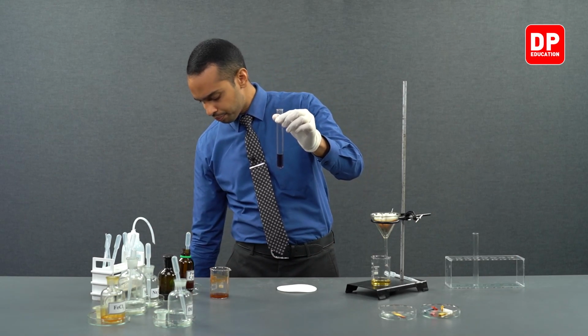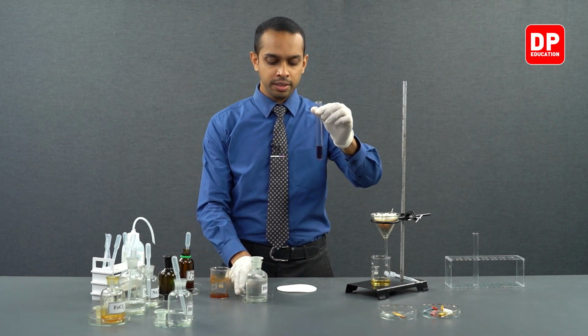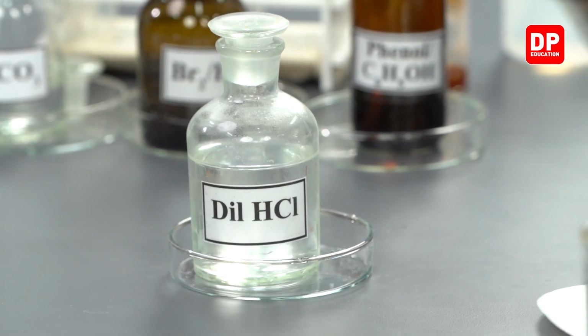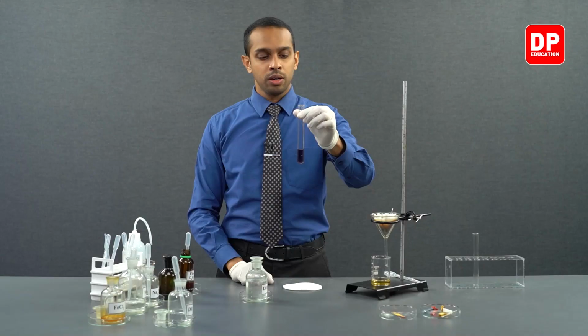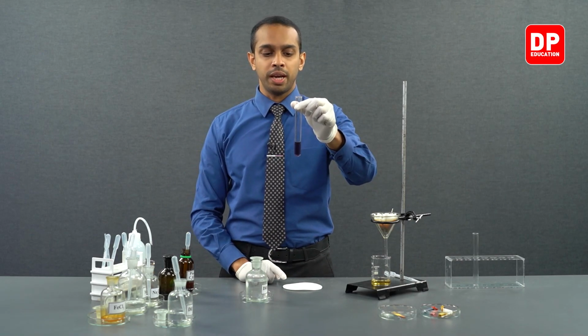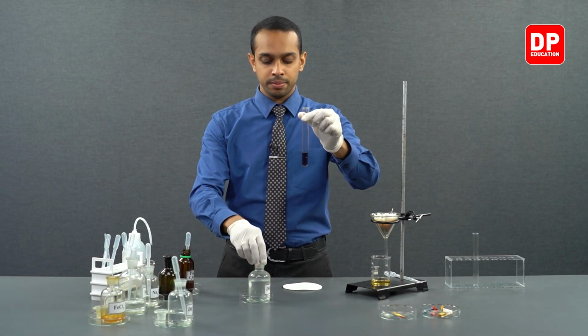We will take our hydrochloric acid. We have here our hydrochloric acid. To our purple color solution we have here, let's add a small amount of hydrochloric acid.